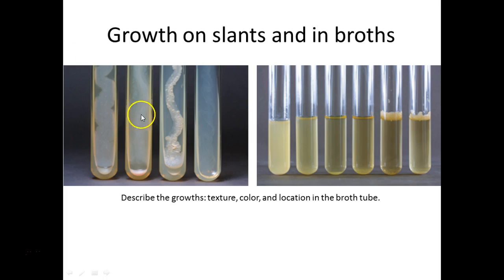But you can see this one is nice and chalky, dry looking, where these are more smooth, kind of whitish in appearance. A couple of you guys have some pigmented ones. Actually, who got the pink? Kelsey got pink? You got pink. All right, that's a new one. I'm excited about that one too. I just gave out one pink one today.